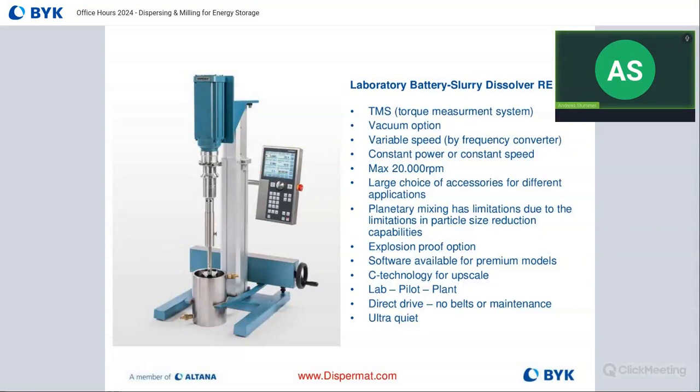So I can either go with constant power or constant speed, depending on how I want to run it. Or if I want to go from small lab scale to manufacturing, I might want to use constant power because it gives me really good quality upscale data. And not only is it easy to process the material, but it will also help to calculate how much energy you would be using to process a certain amount of material in a certain amount of time when I'm using constant power, because I know exactly how much energy I'm using.